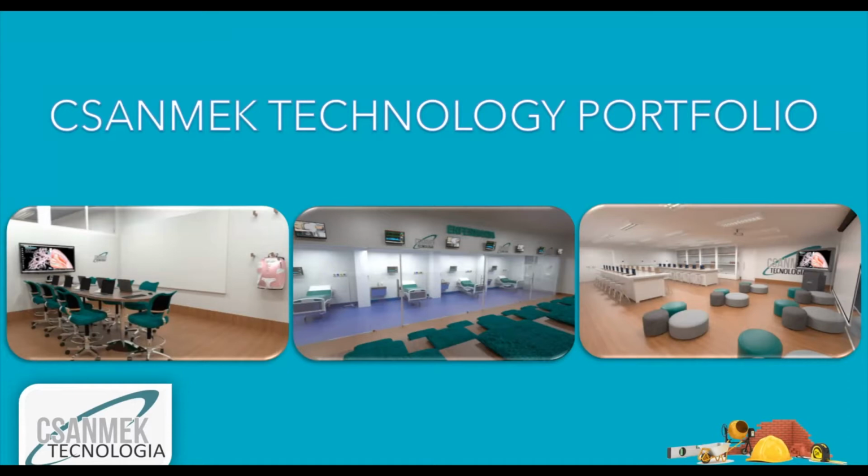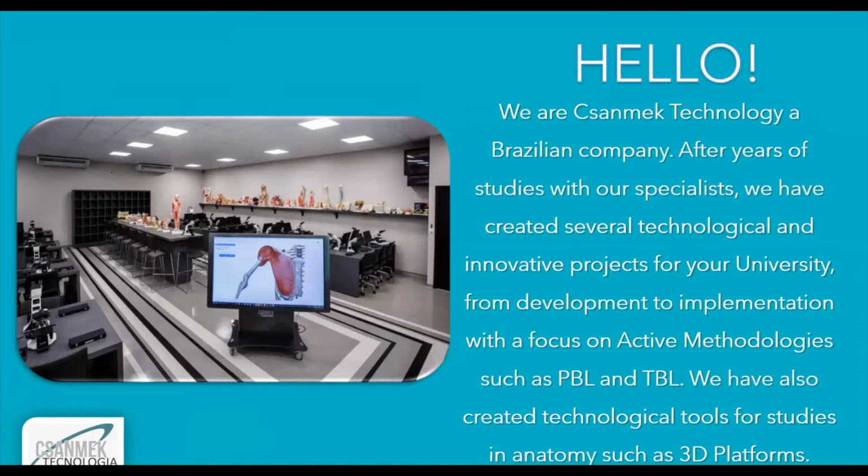Going through our portfolio here, let me just share it here. Okay. Here's an example, you can see in the picture, of teaching solutions that we do. So it contains microscopes, it contains the platform itself. This is the physical platform we will talk about. It contains physiological models.